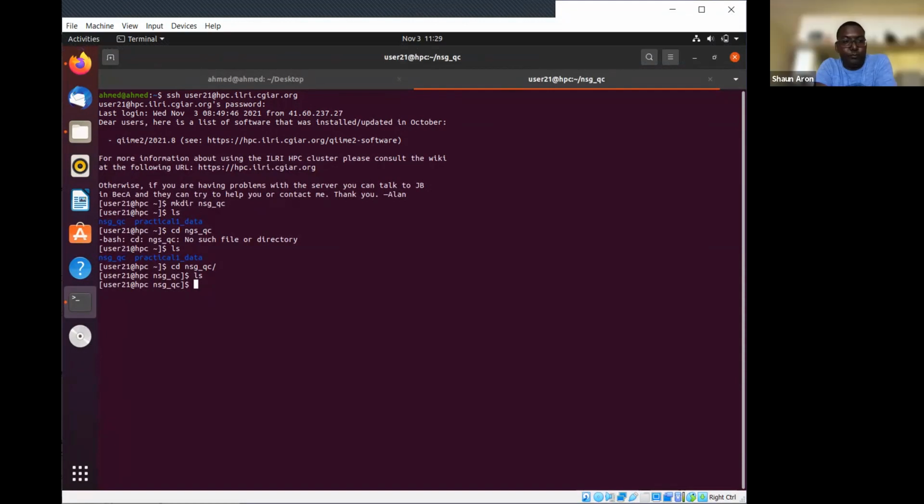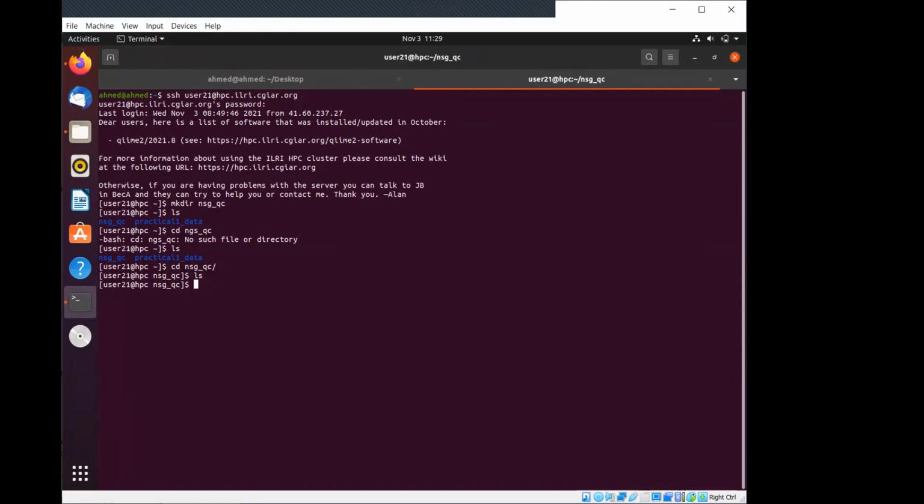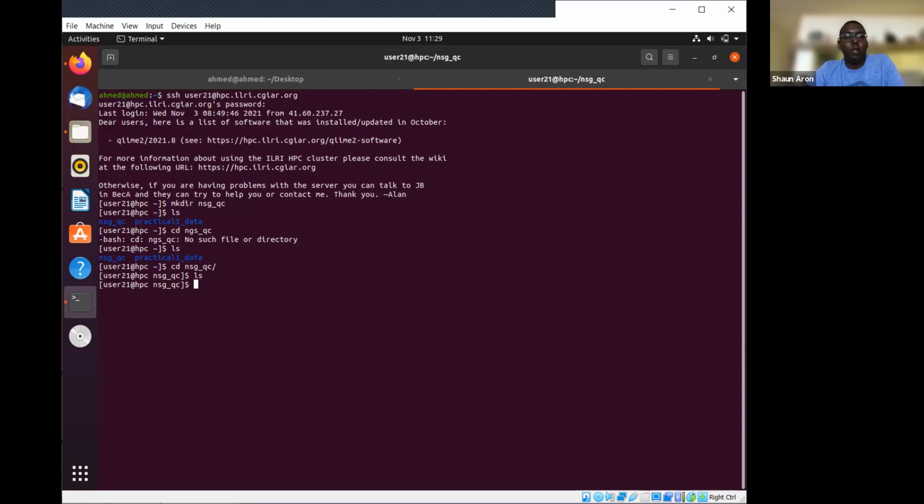Sure. Yeah, I'm here in the terminal, but I missed that long code you wrote to copy the file from the... Oh, okay, so you don't have the file. It's the wget command. I'll just put it back in the chat. One second. You're better off copying and pasting it rather than trying to type the whole thing out. Here it is.